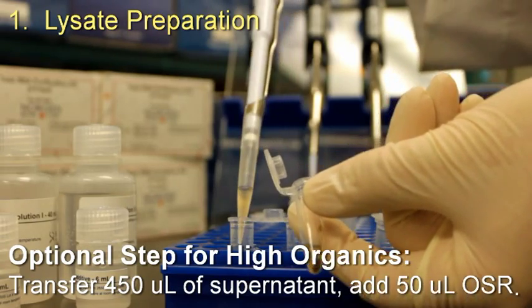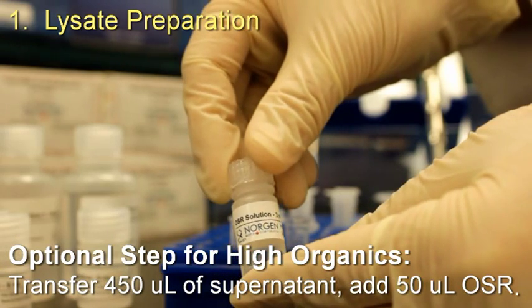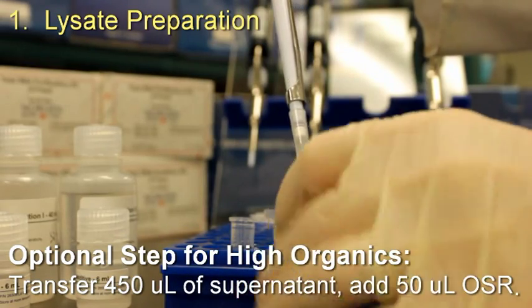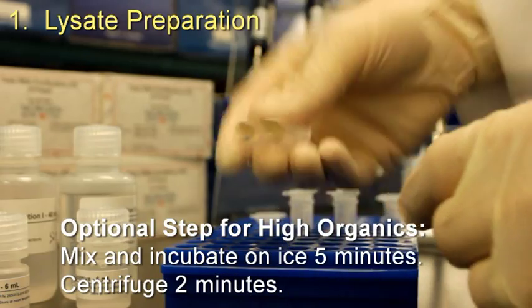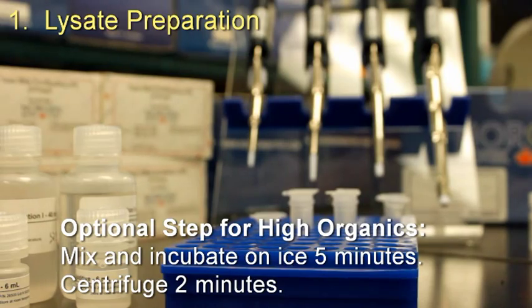For samples containing high organics, transfer 450 microliters of supernatant to a microcentrifuge tube and add 50 microliters of solution OSR. For typical soil samples, you may skip this and go straight to step 1i. Mix and incubate on ice for 5 minutes and centrifuge for 2 minutes.